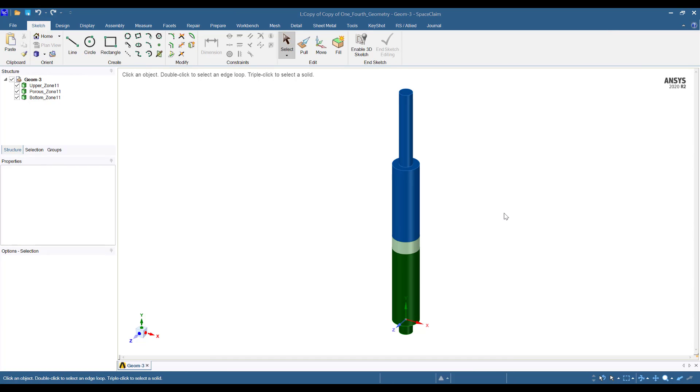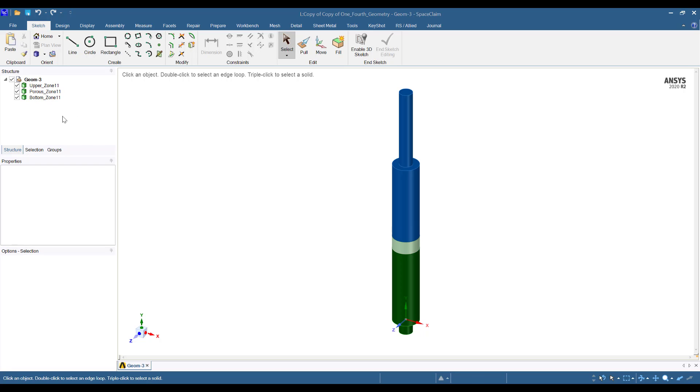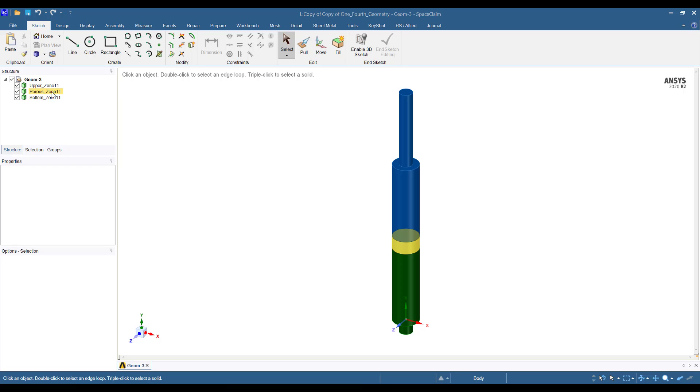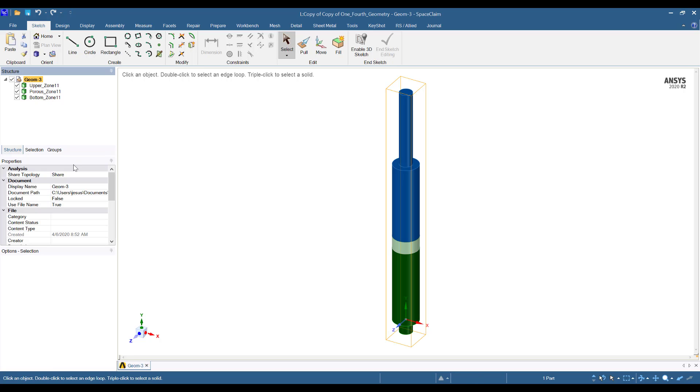The geometry was built in ANSYS Space Claim. As you can see here, it is composed by three bodies: the bottom zone, the upper zone, and the porous zone. All three regions or solids share their topology. Then you can see here that the share topology option is enabled.